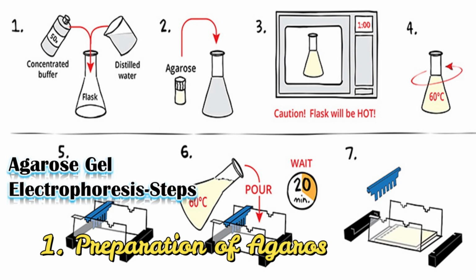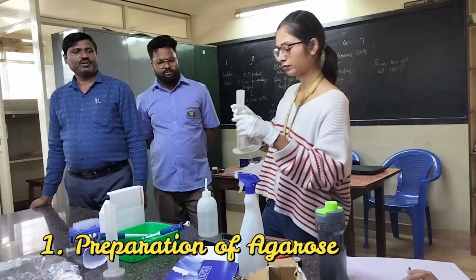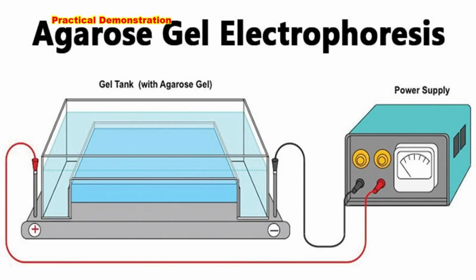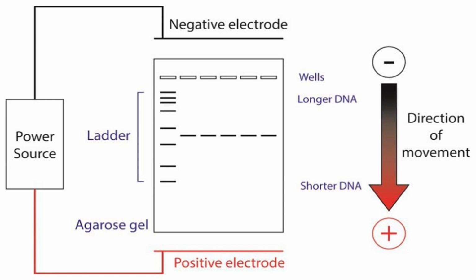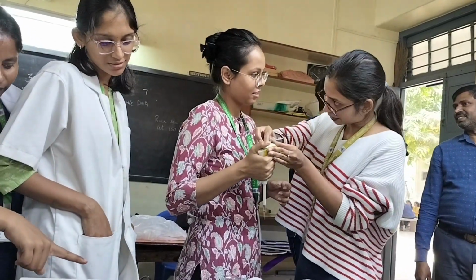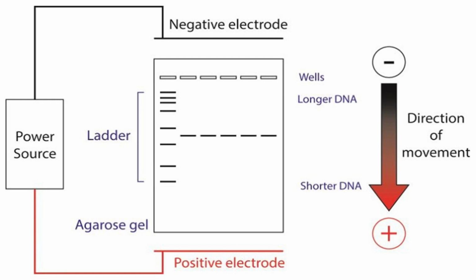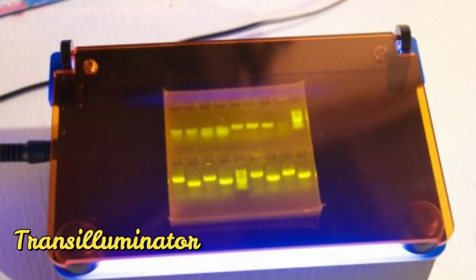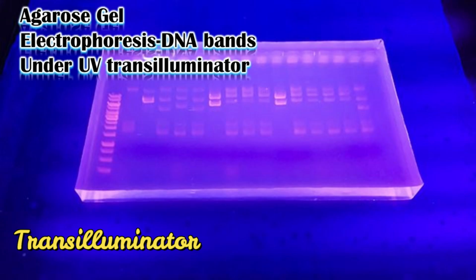Purified agarose is a powder which is insoluble in water or buffer at room temperature but dissolves on boiling. In fact, agarose is a linear polymer extracted from seaweeds. Electrophoresis is a technique used to separate charged molecules in a gel. DNA is negatively charged at neutral pH. When an electric field is applied across the gel, DNA migrates towards the anode. Migration of DNA in the gel depends on molecular size of the DNA, agarose concentration, conformation of DNA, and applied current. Visualization of DNA fragments is usually done under UV light. Under UV light, DNA appears fluorescent.